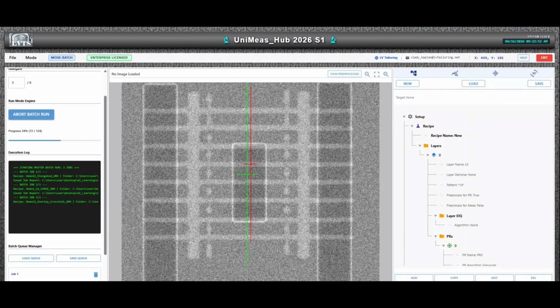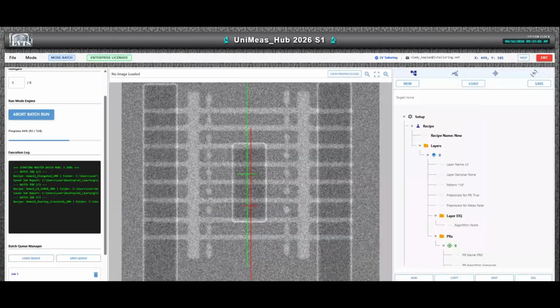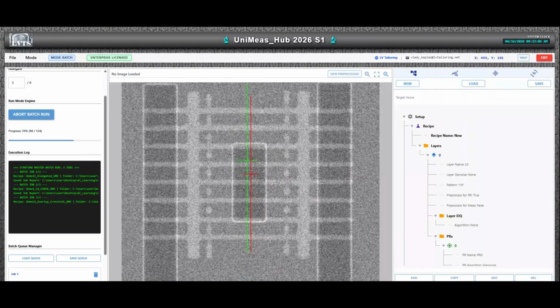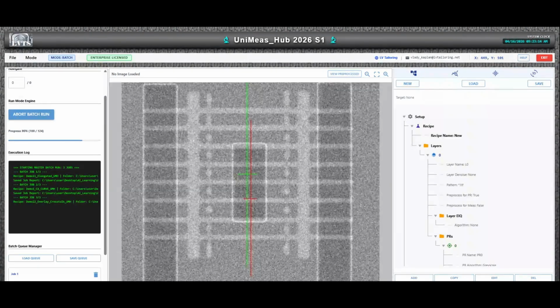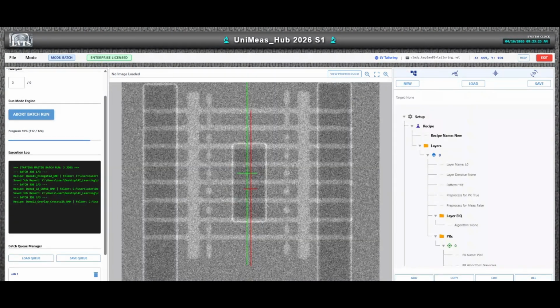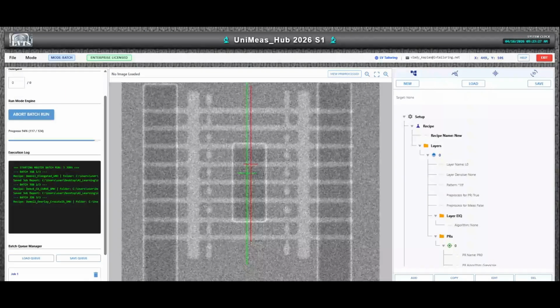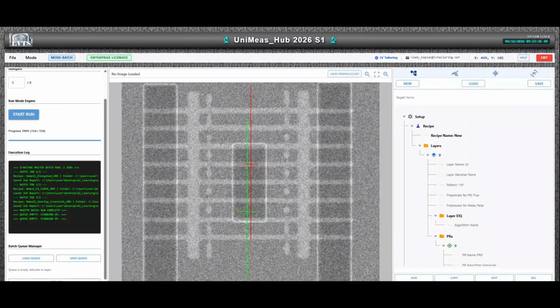The execution engine automatically generates a fully compiled HTML report and exports the comprehensive measurement arrays into organized Excel files. These reports contain every single raw data point collected across the run, proving this isolated architecture scales perfectly across hundreds of images without manual intervention.